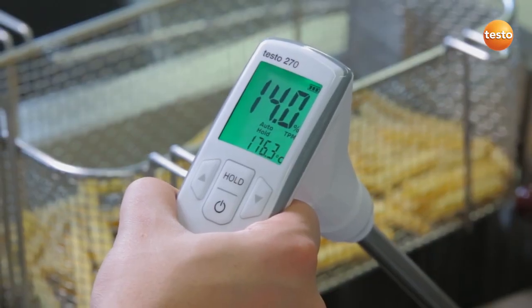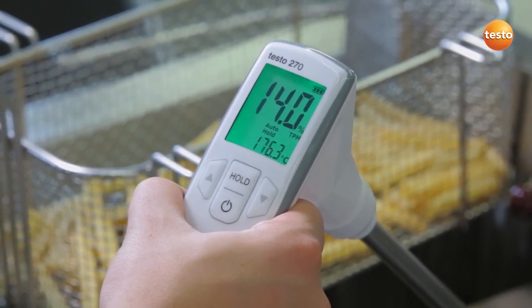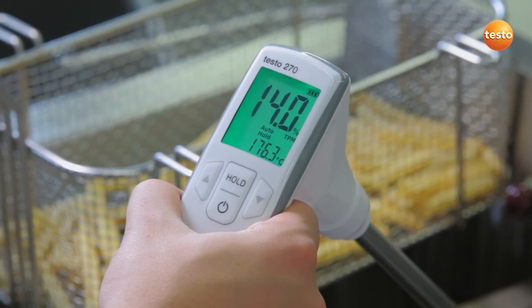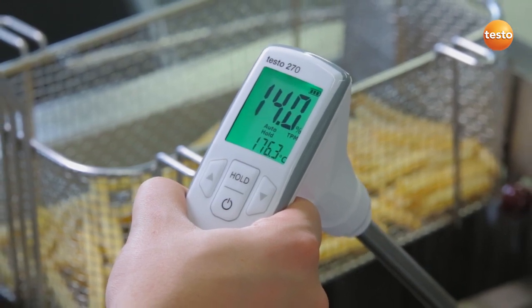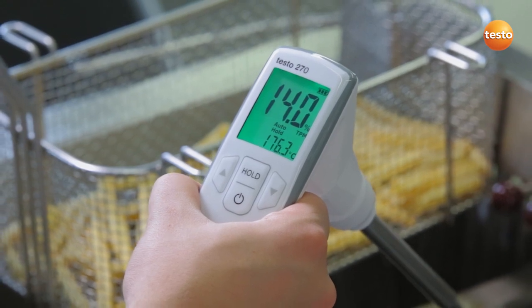The measurement results appear in the display. The smaller value shows the temperature of the cooking oil. The larger value, and the more important one, is the TPM value. This gives the polar components in the oil, which are a sure indicator for the quality of the cooking oil.